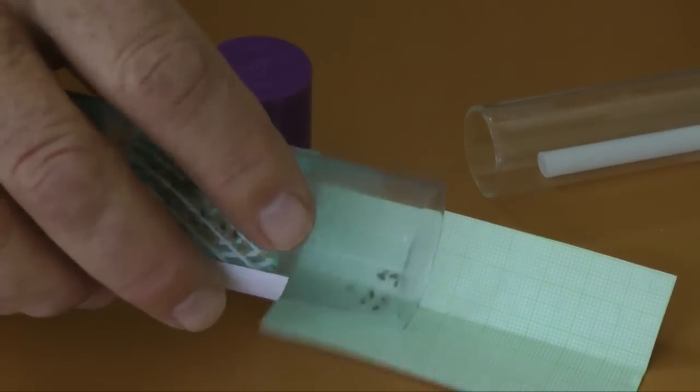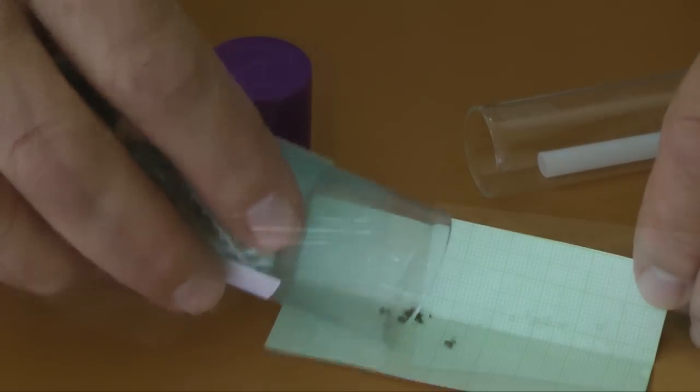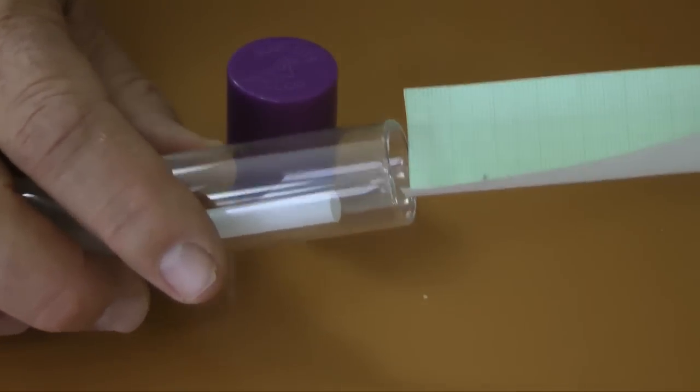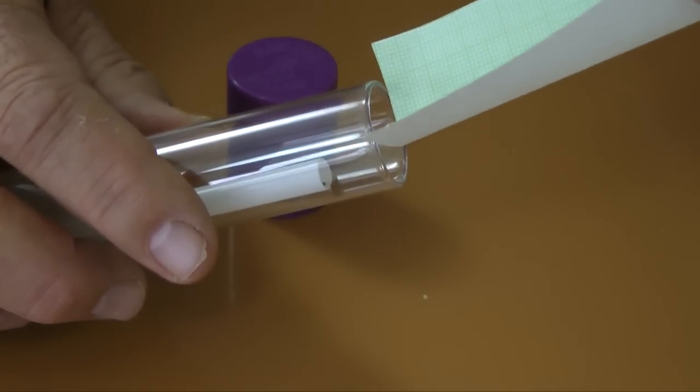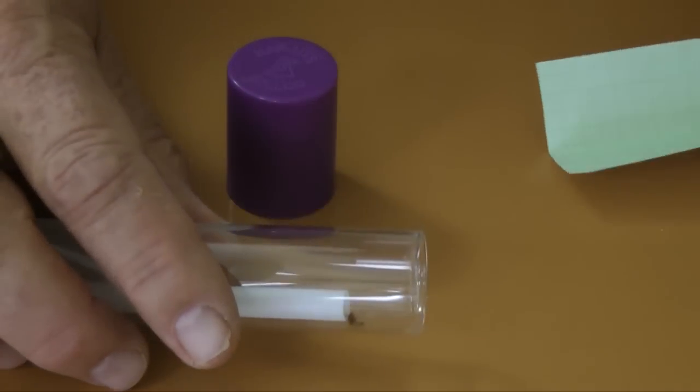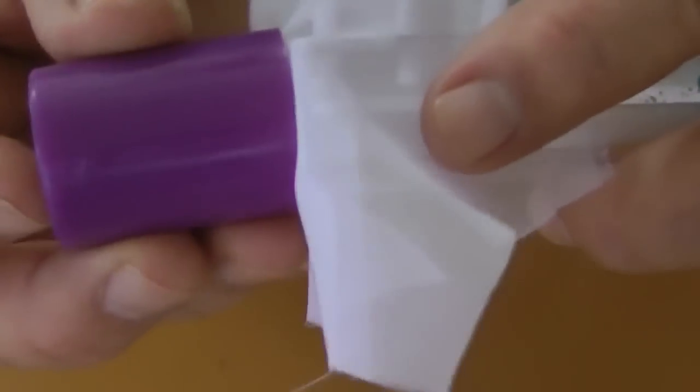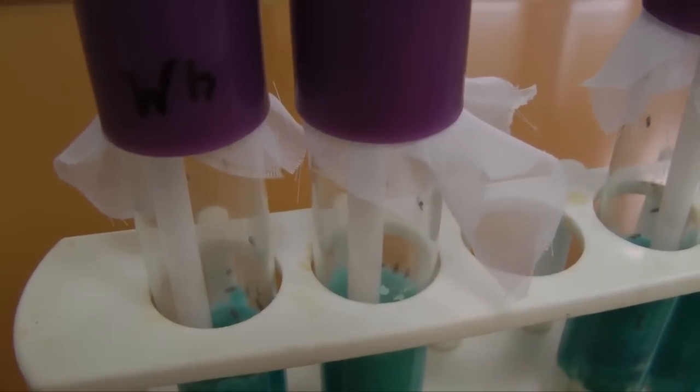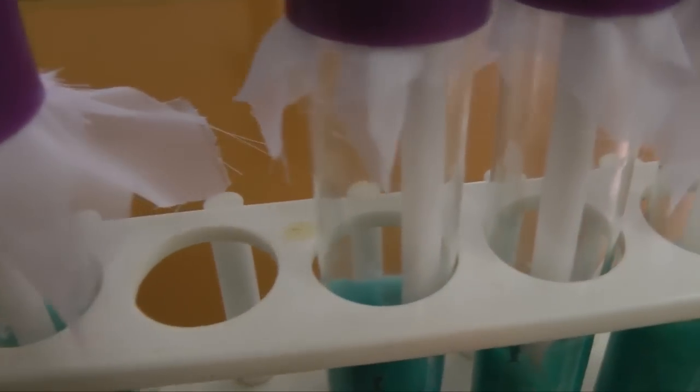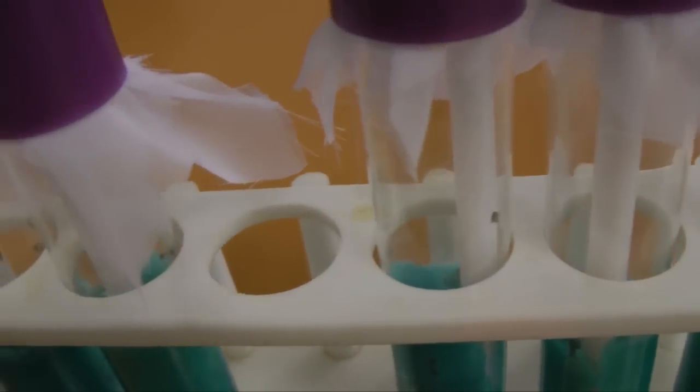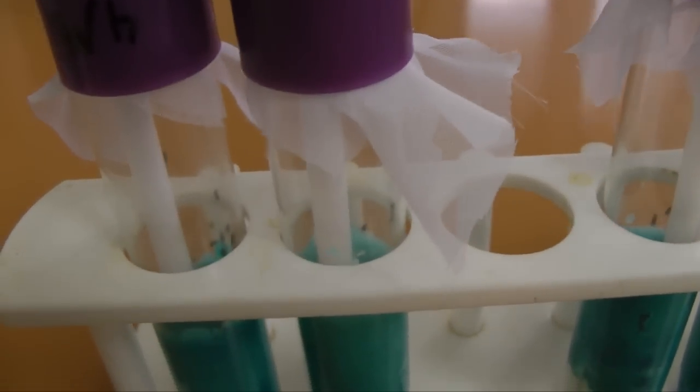Acting quickly, transfer flies into the new tubes. Keep the tubes on their side so the flies don't stick to the wet media. I'm using a banded fabric to cover the tubes. The caps fit loosely, allowing air exchange. As the flies warm up, they return to normal activity. Label the tubes with date and fly type.